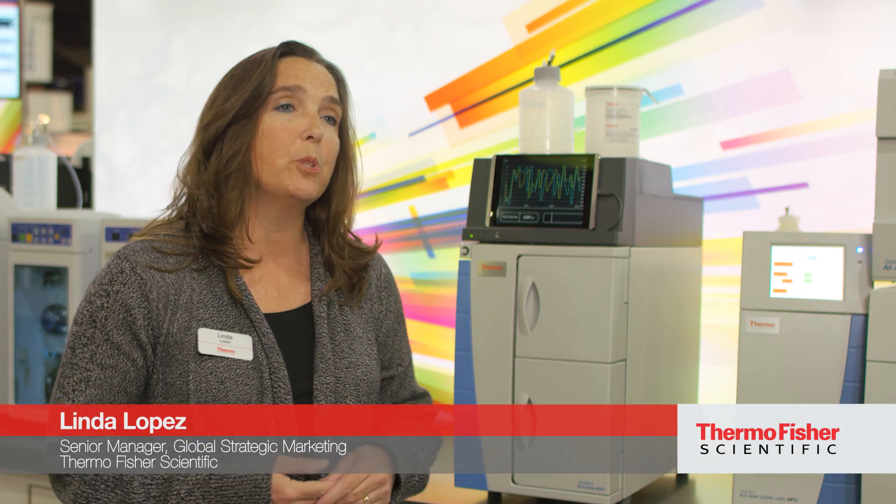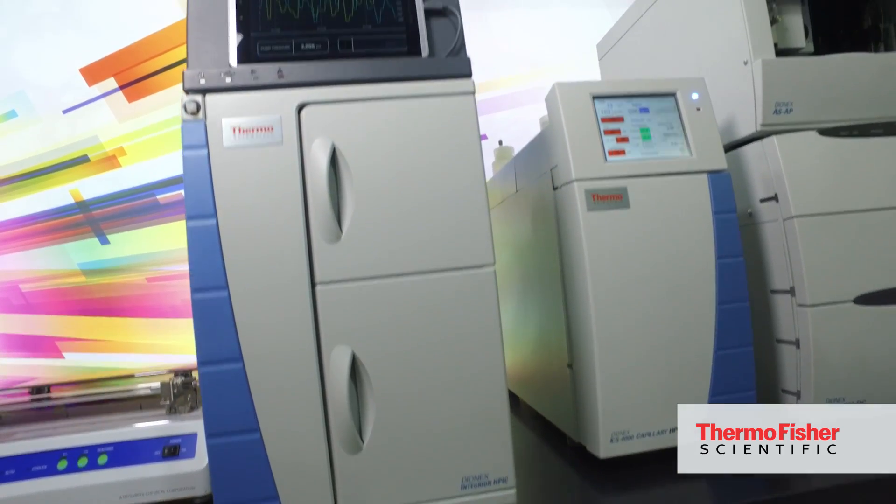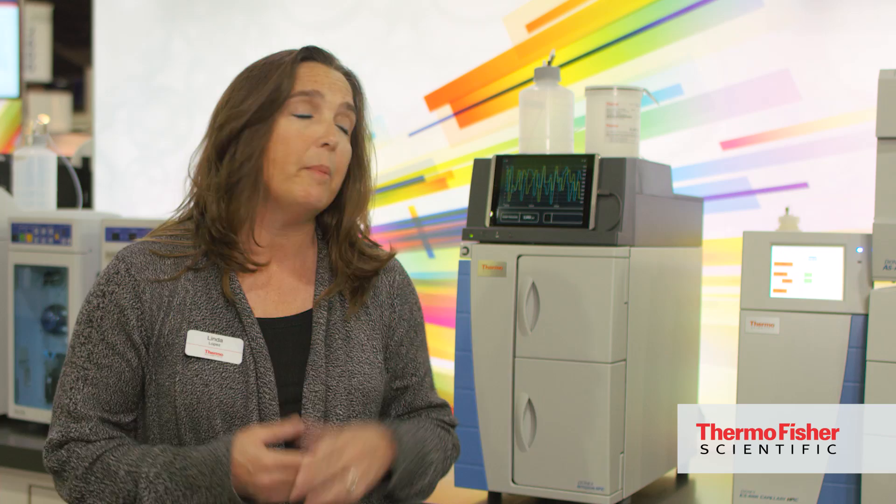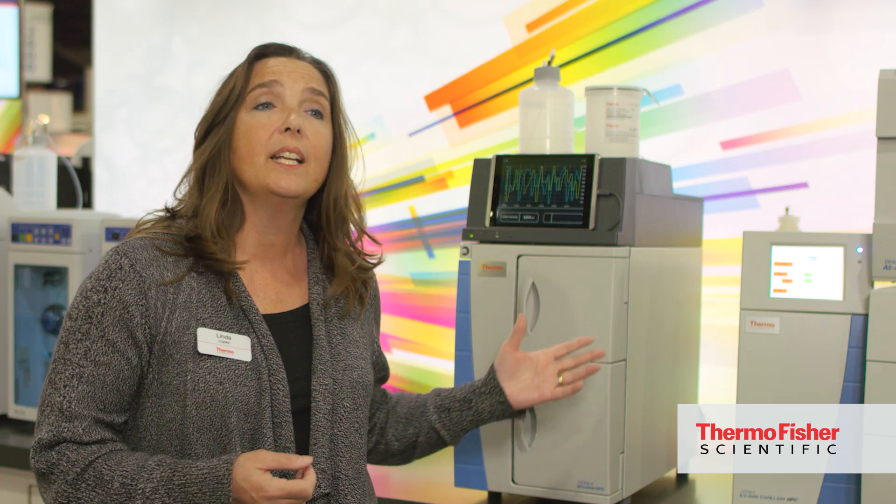I'd be happy to talk to you today about the Thermo Scientific Dionex Integrion HPIC system. It's a very important system for the determination of environmental drinking water. It's a huge environmental concern. Drinking water impacts human health on a global scale, and this instrument is located in every corner of the globe doing water testing for contaminant analysis.